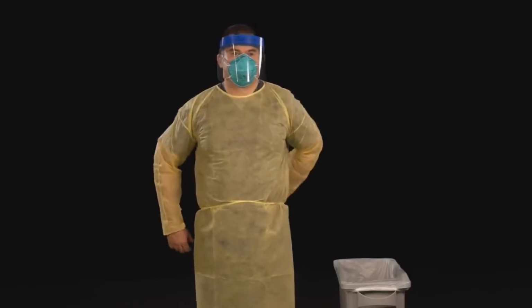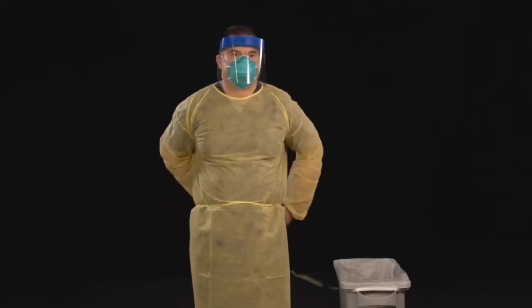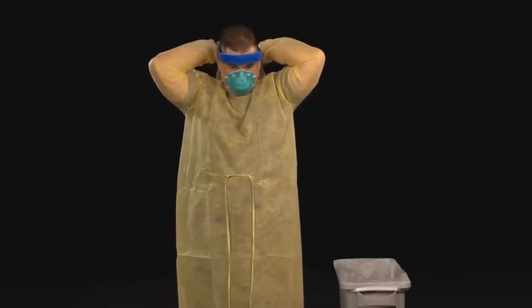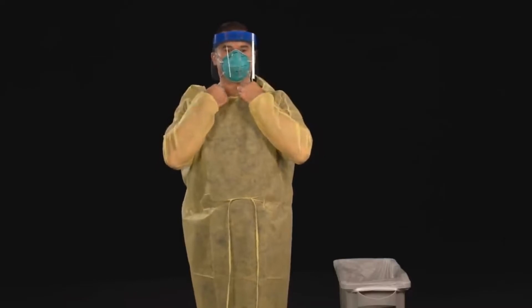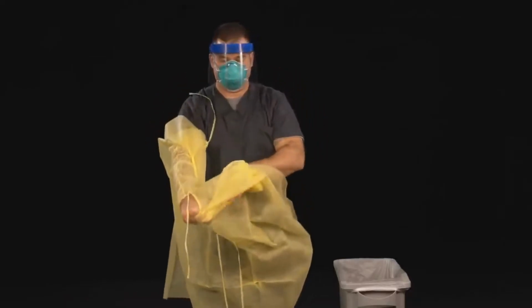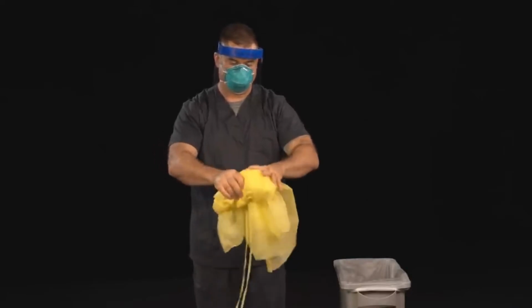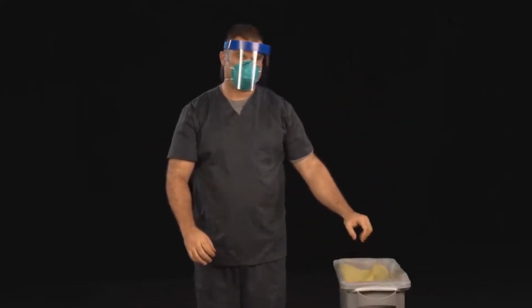Next, remove your gown. Untie all ties or unsnap all snaps. Some gown ties can be broken rather than untied. In that instance, break the ties gently, avoiding a forceful movement. Reach up to the shoulders and carefully pull or roll the gown down and away from the body. Dispose of the used gown. You may now exit the patient's room.